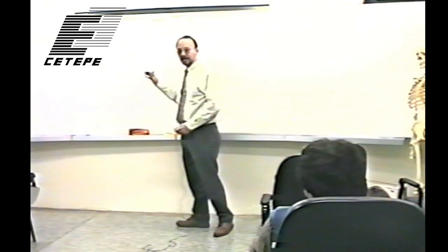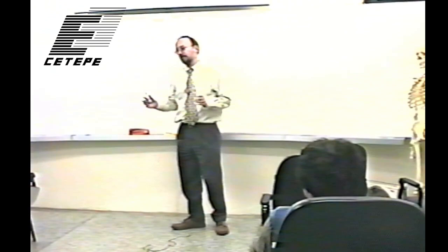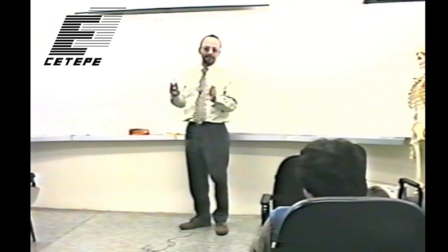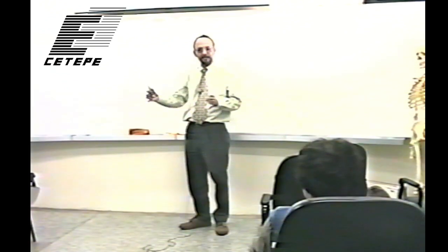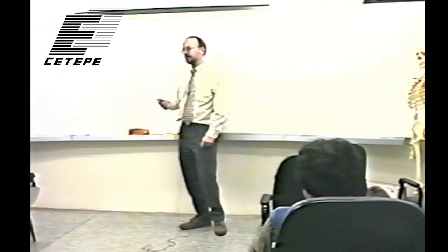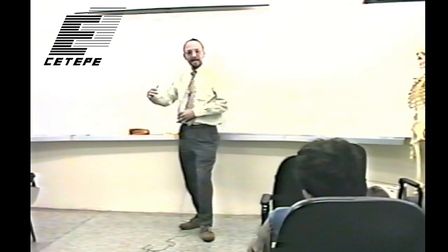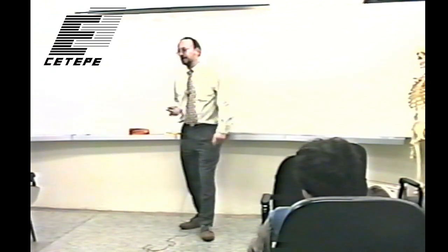Many modern imagers now, and I don't think this will last very long, but for about a 20-year time window, between maybe the early 80s and early in the next century, CCDs have been very, very popular as digital imaging devices. I believe that in radiology, at least, they're going to be replaced by these large format flat panel arrays, which I'll also show you. But at the moment, they're still kind of state of the art.